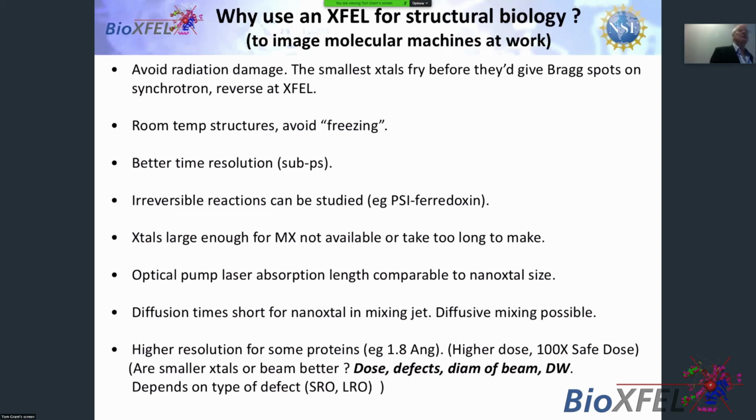Okay, I'm going to finish by telling people why you would use an XFEL, because the obvious question to ask is, why do I need an XFEL rather than a synchrotron? Well, I've hinted at the reasons throughout my talk. To avoid radiation damage, outrun damage, to look at room temperature structures and avoid the effects of freezing, which we call cooling artifacts, to get in cases where you do need better time resolution.